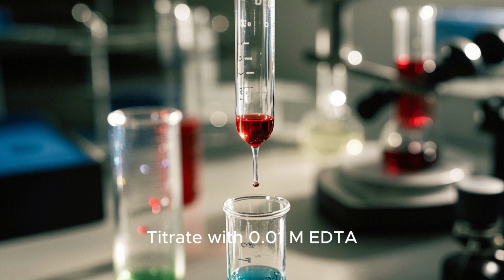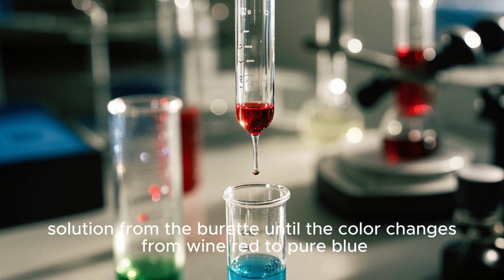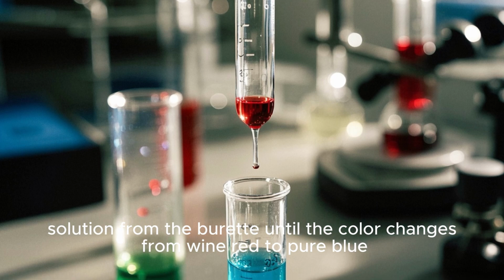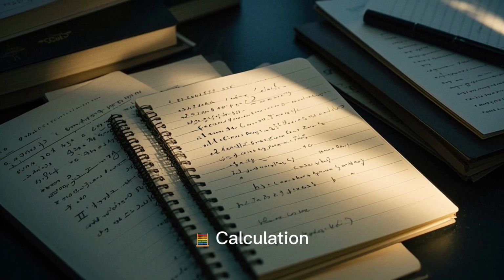Titrate with 0.01 M EDTA solution from the burette until the color changes from wine red to pure blue. Endpoint: wine red to pure blue. Calculation.